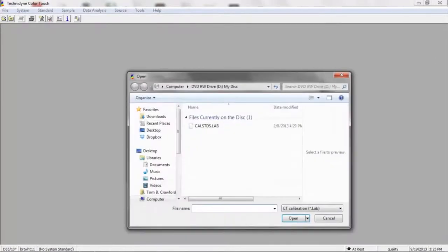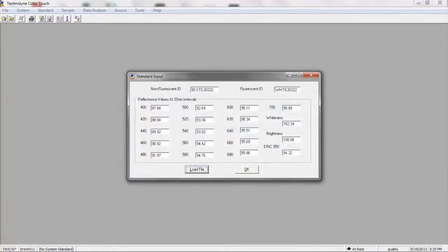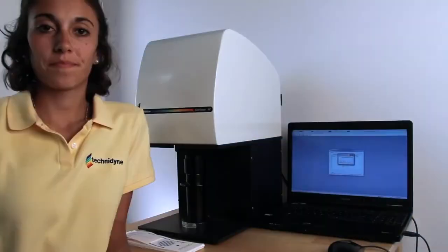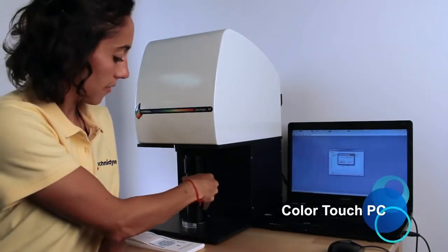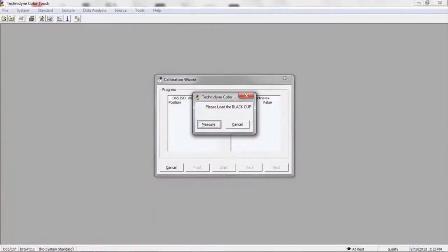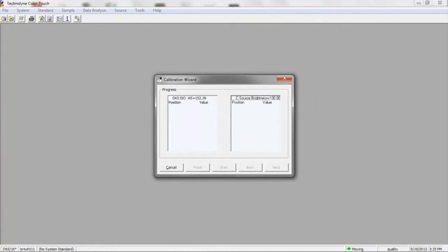Once your CD is loaded, you'll press Load File and select Cal Standards Lab. The CD will automatically fill in the values, and you can press Load File. Our next step is to load our black cup and press Measure. This is to set the zero level for the calibration.